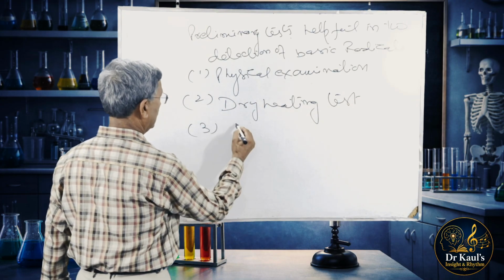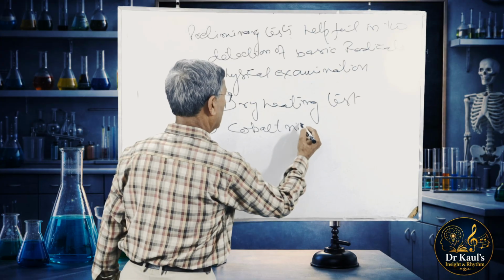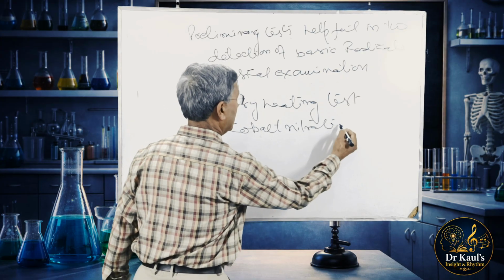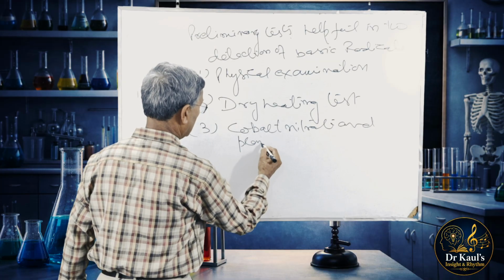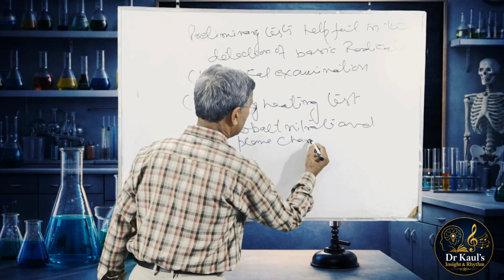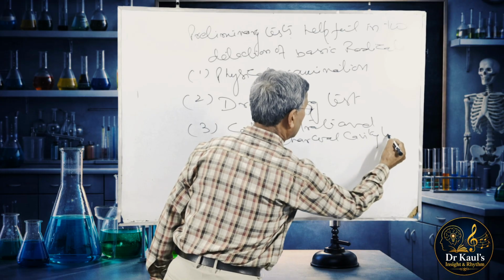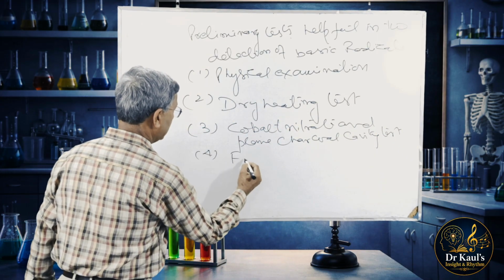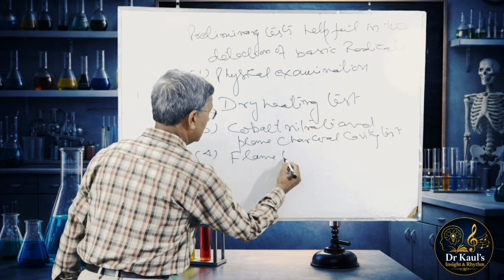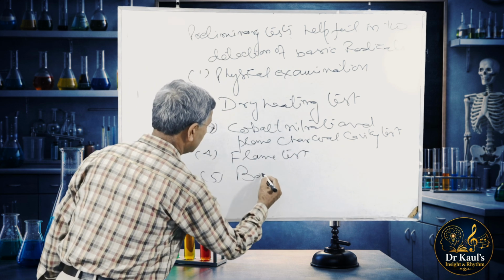Number three, cobalt nitrate and plain charcoal cavity test. Then flame test and borax bead test.